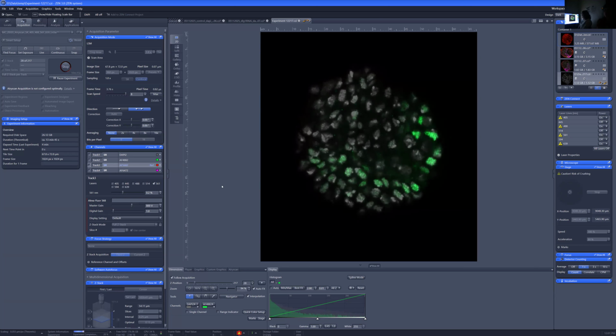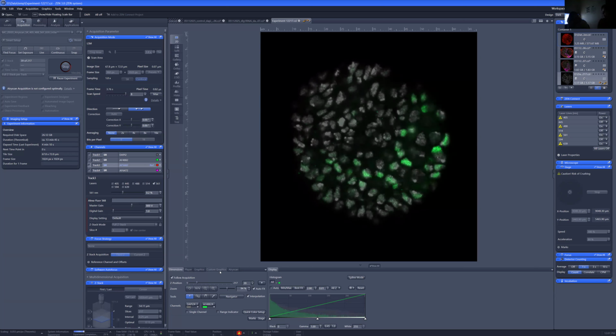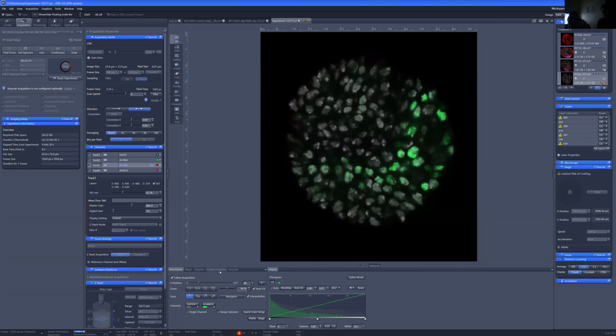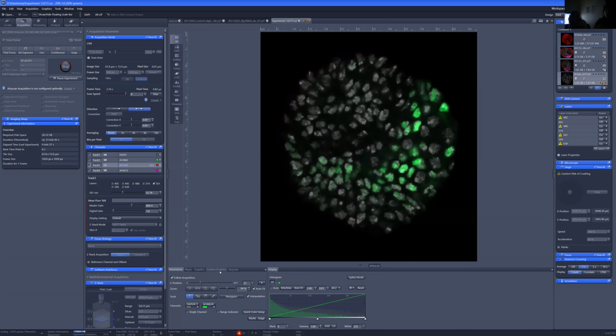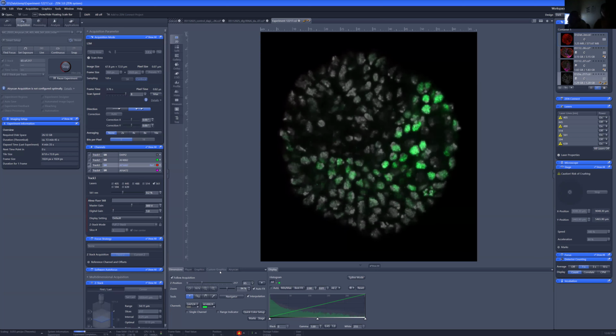And so functionally what's happening in terms of the microscope is, when it was imaging the DNA, it was shining one laser on, and then collecting the re-emitted light from that laser, of one color. And now it is shining a separate laser on, collecting the information that is re-emitted by the cells and by the fluorophores from that laser. And it is overlaying the 2 re-emitted wavelengths in terms of visually what you're seeing. Yeah, exactly.